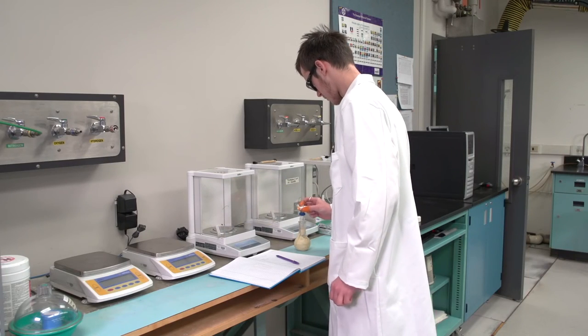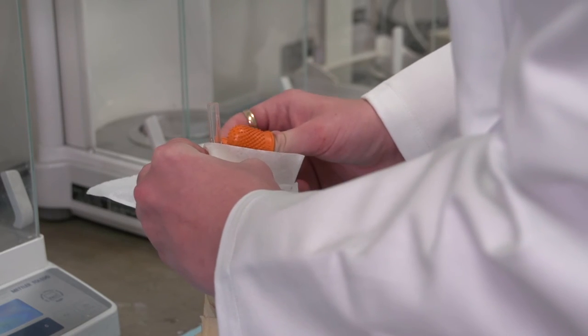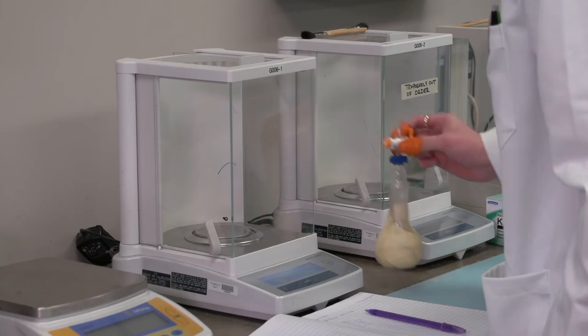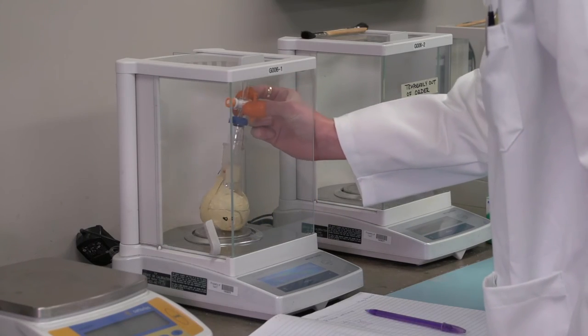Remove the bottle from the balance. To fill the bottle with air, open the stopcock. Determine the new mass on the balance.